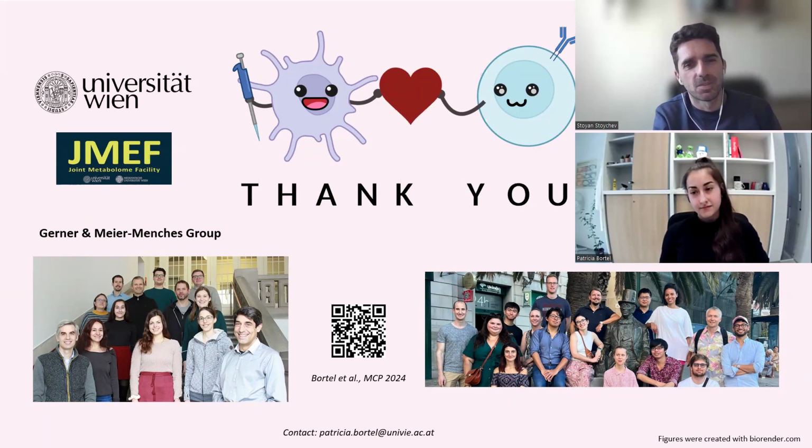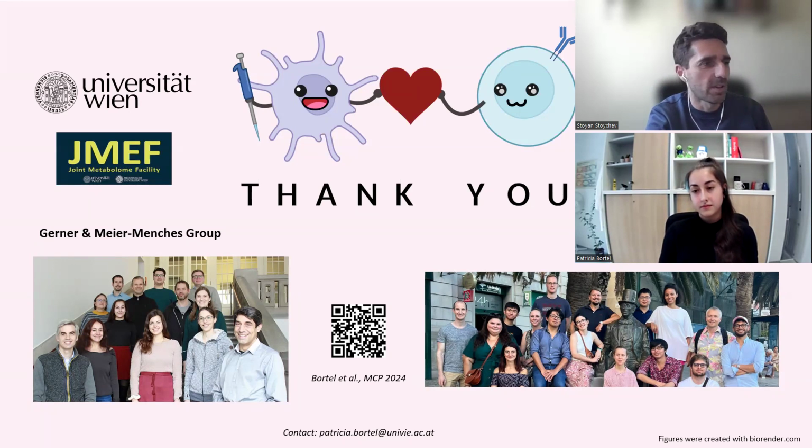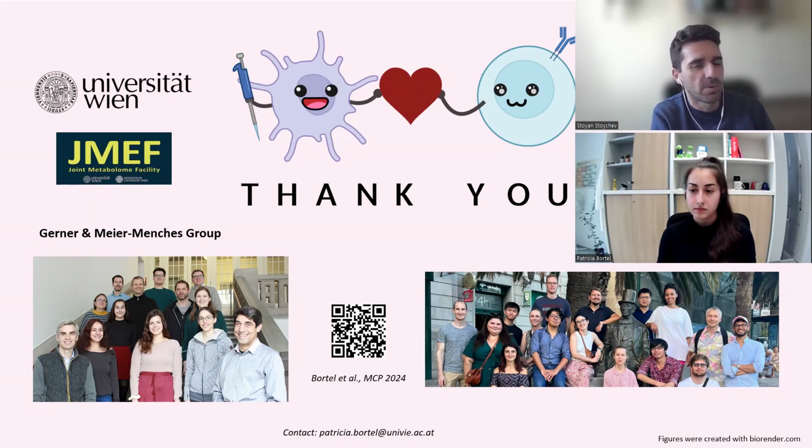This was great. I think a very thorough and systematic evaluation of different parameters. We already have a few questions coming in, so I'm just going to jump straight into them. The first one is from Owen. He's basically asking about the input amounts and whether you've tested anything above 30 micrograms, specifically with the sequential enrichment, whether there's any benefit to doing sequential enrichment with anything higher than 30 micrograms.